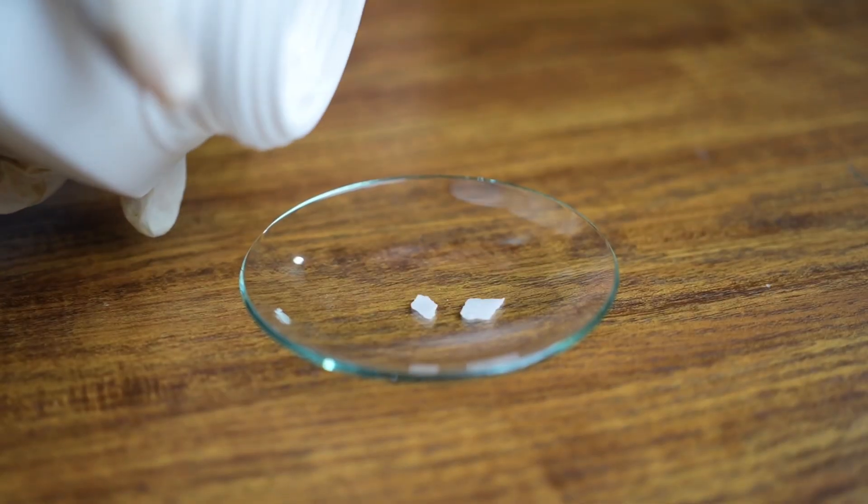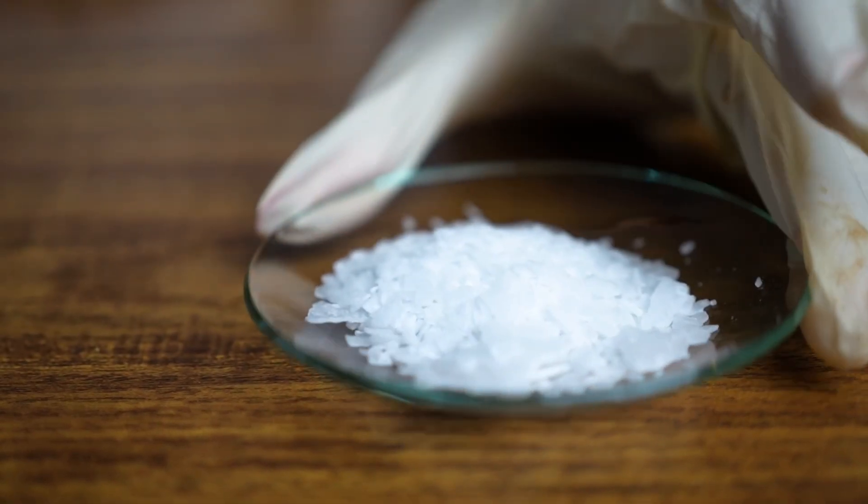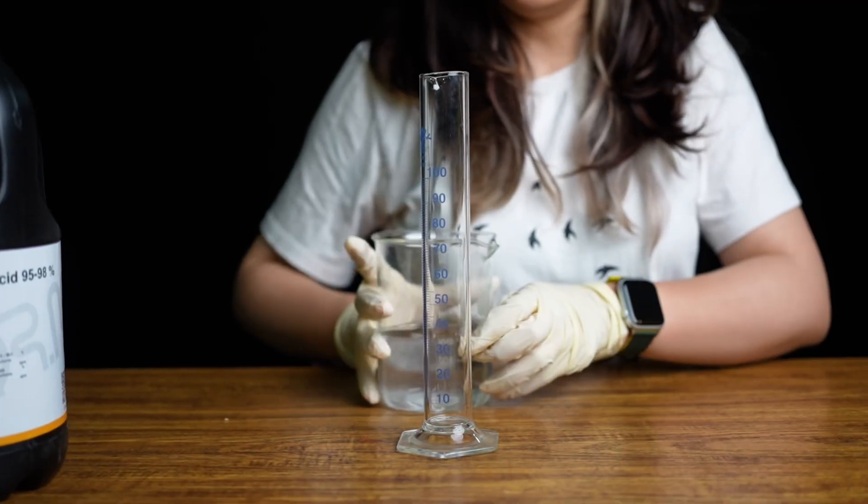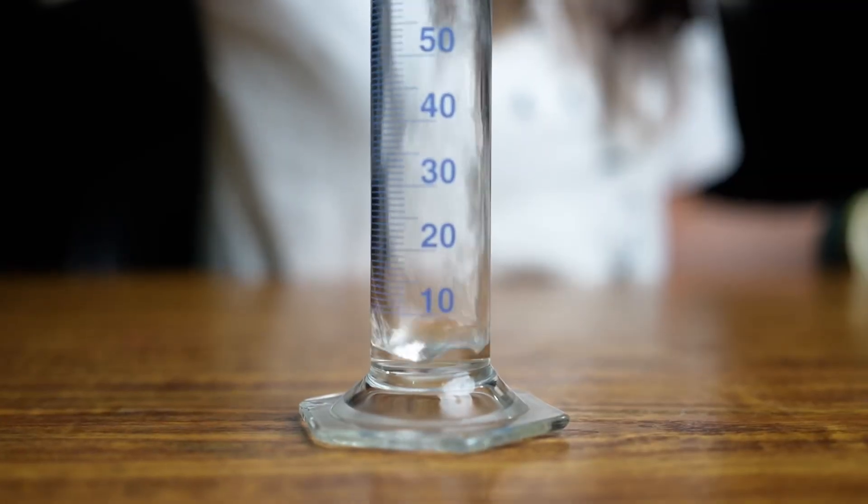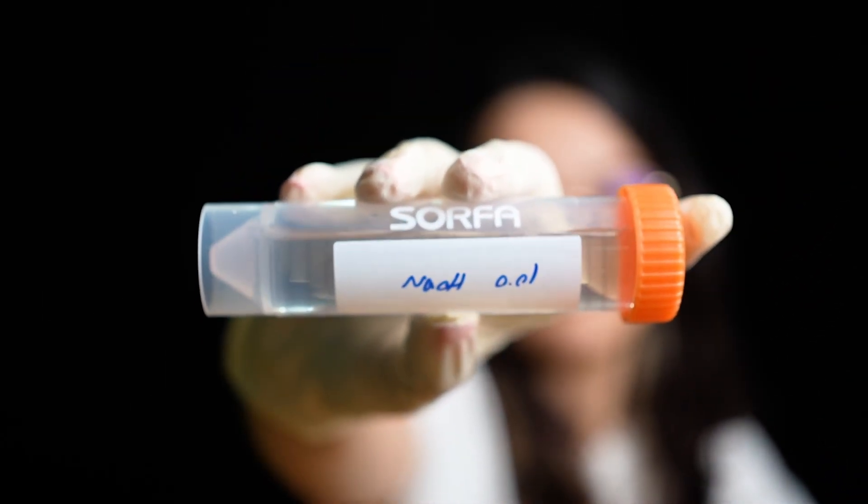I am using sulfuric acid and sodium hydroxide to perform a simple acid base titration. I used sulfuric acid with 98% purity and prepared sodium hydroxide with a concentration of 0.01 molar.